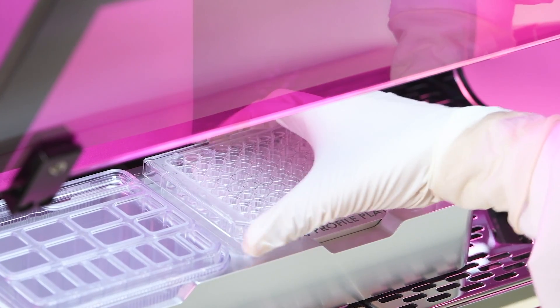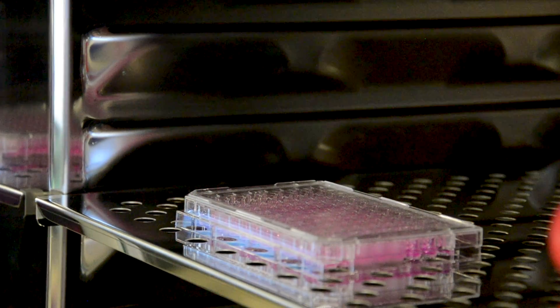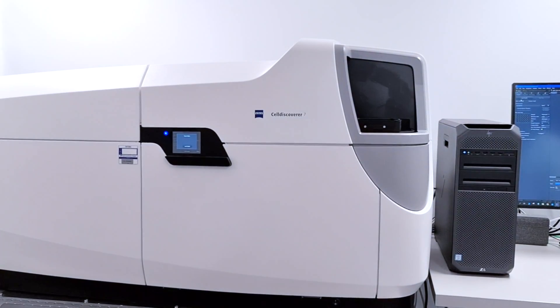Once the print is finished, remove the plate, add media and return to the incubator. 3D cell models can be imaged or analyzed periodically as required.